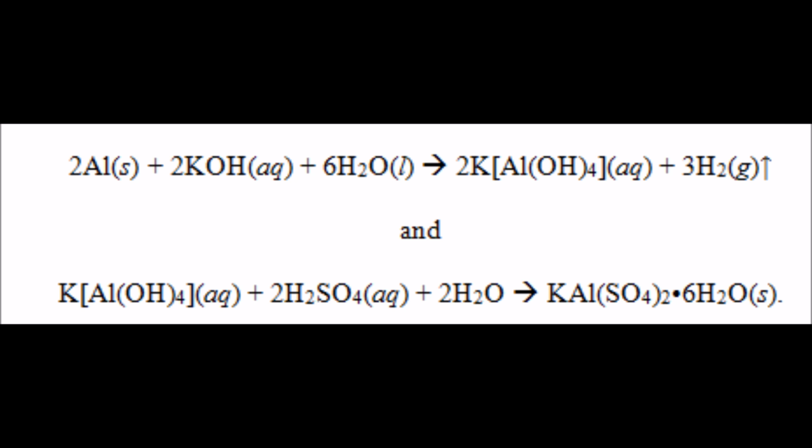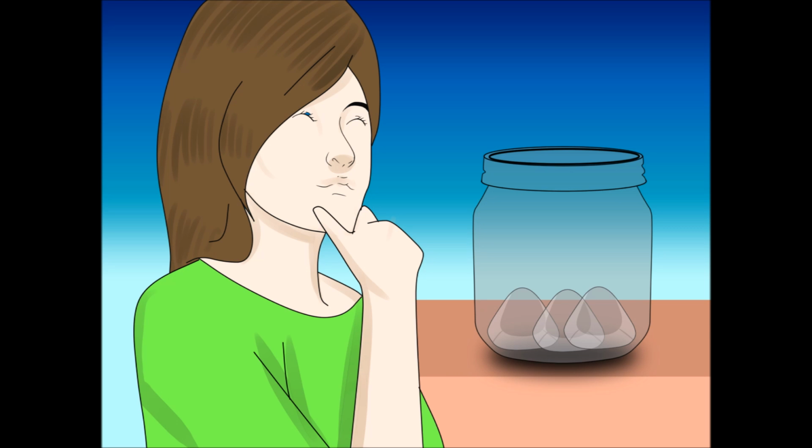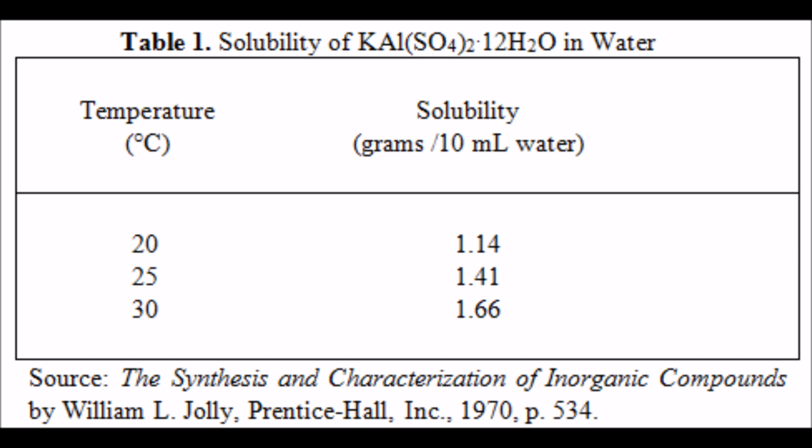The alum was then placed in an ice bath, which lowered the temperature of the system and therefore lowered the kinetic energy. This shifted the system out of equilibrium, causing the solid alum crystals to form. These alum crystals were then filtered out and were a fine white powder.